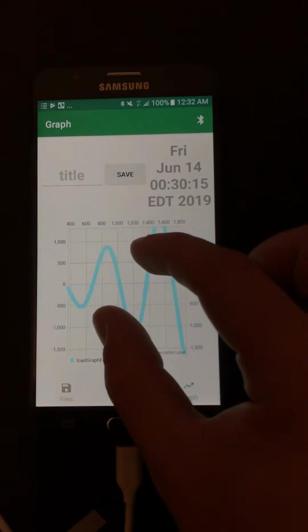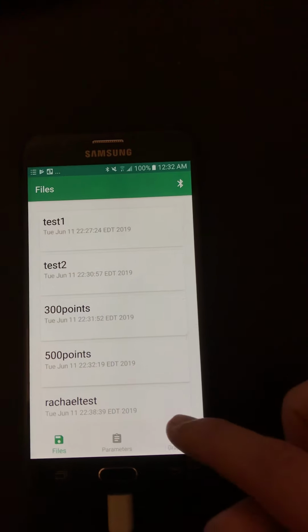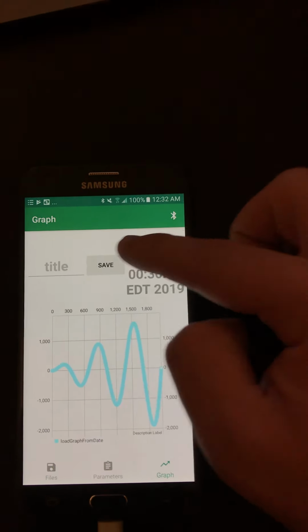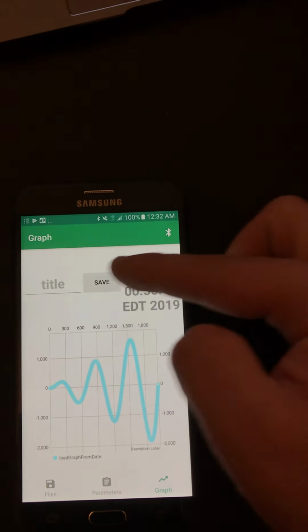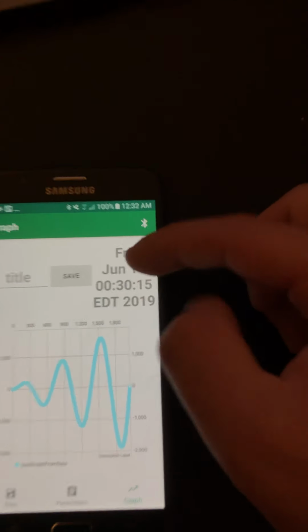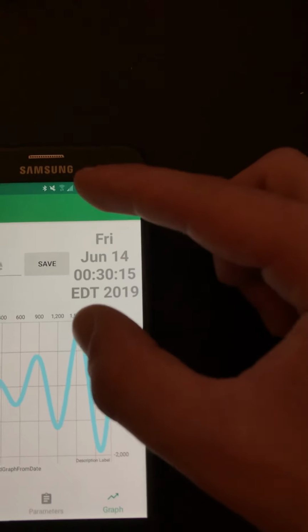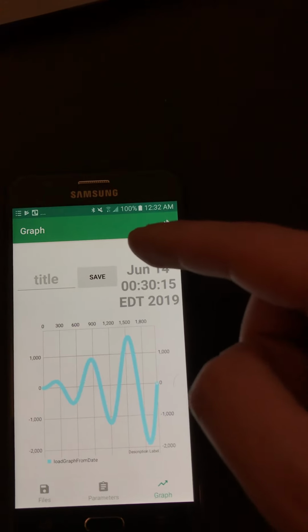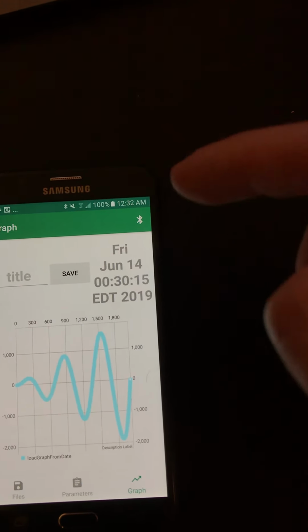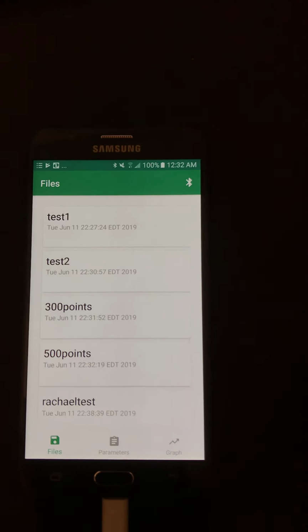And so right now it's working well enough that I think it could be demoed. This text is supposed to be smaller. That's another issue. It's only supposed to be one little bar, but it matches the size of the date, and then I have the date made too big. I want to just make it like a 6, 14, 19, but I don't have that yet. So that's it.